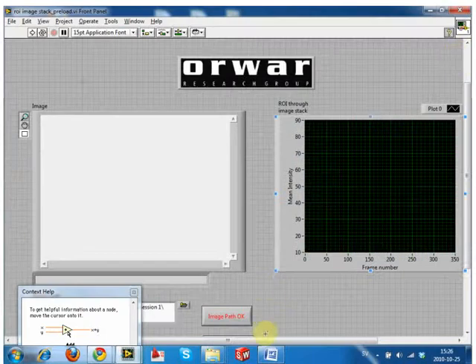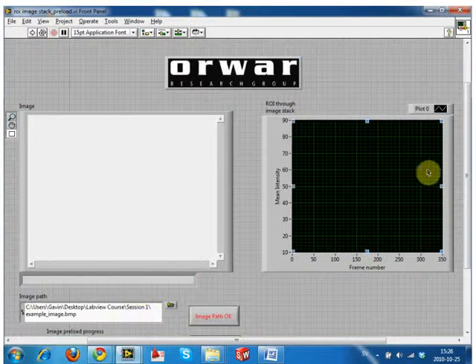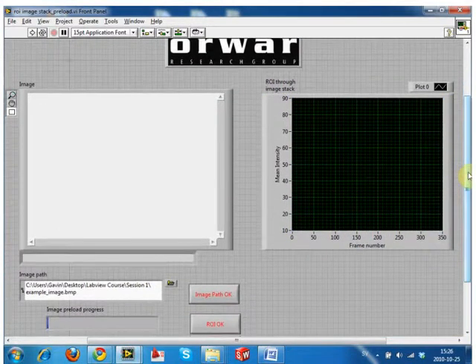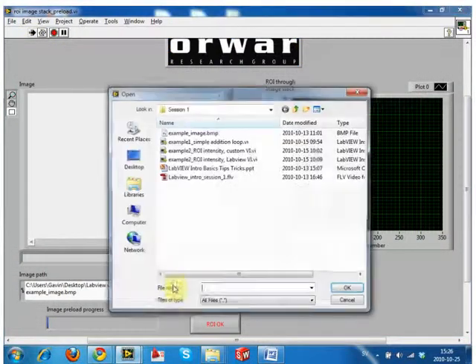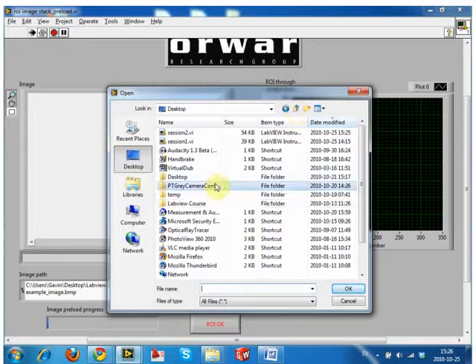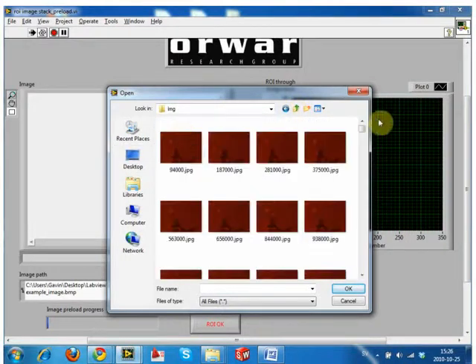It's got a slightly different structure, and there's a little video on the server about how it's being built. It runs in a similar way. If we run it, we can choose our location for the data, and then pick the frame you want to look at for analysis. So let's say this one.